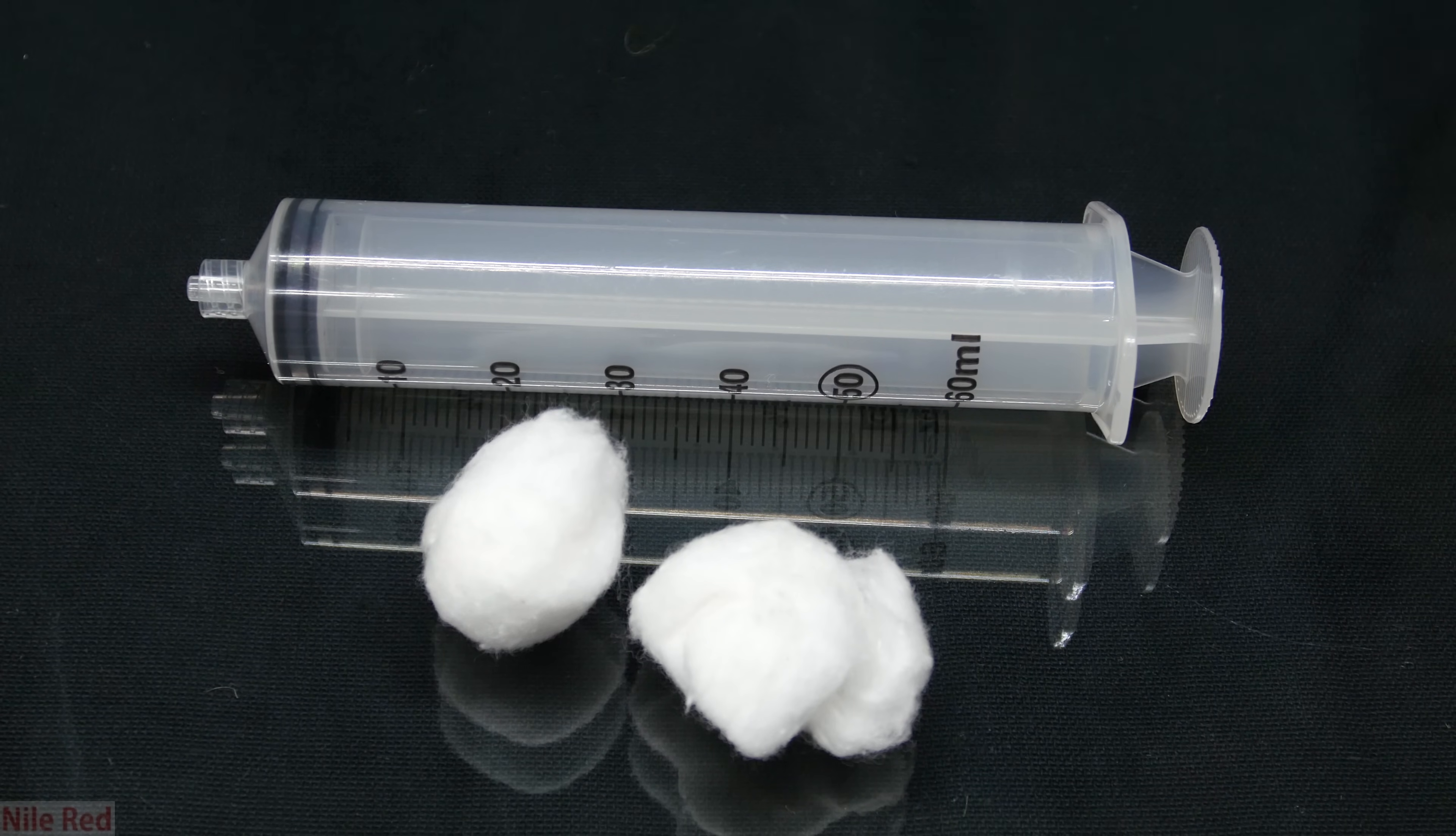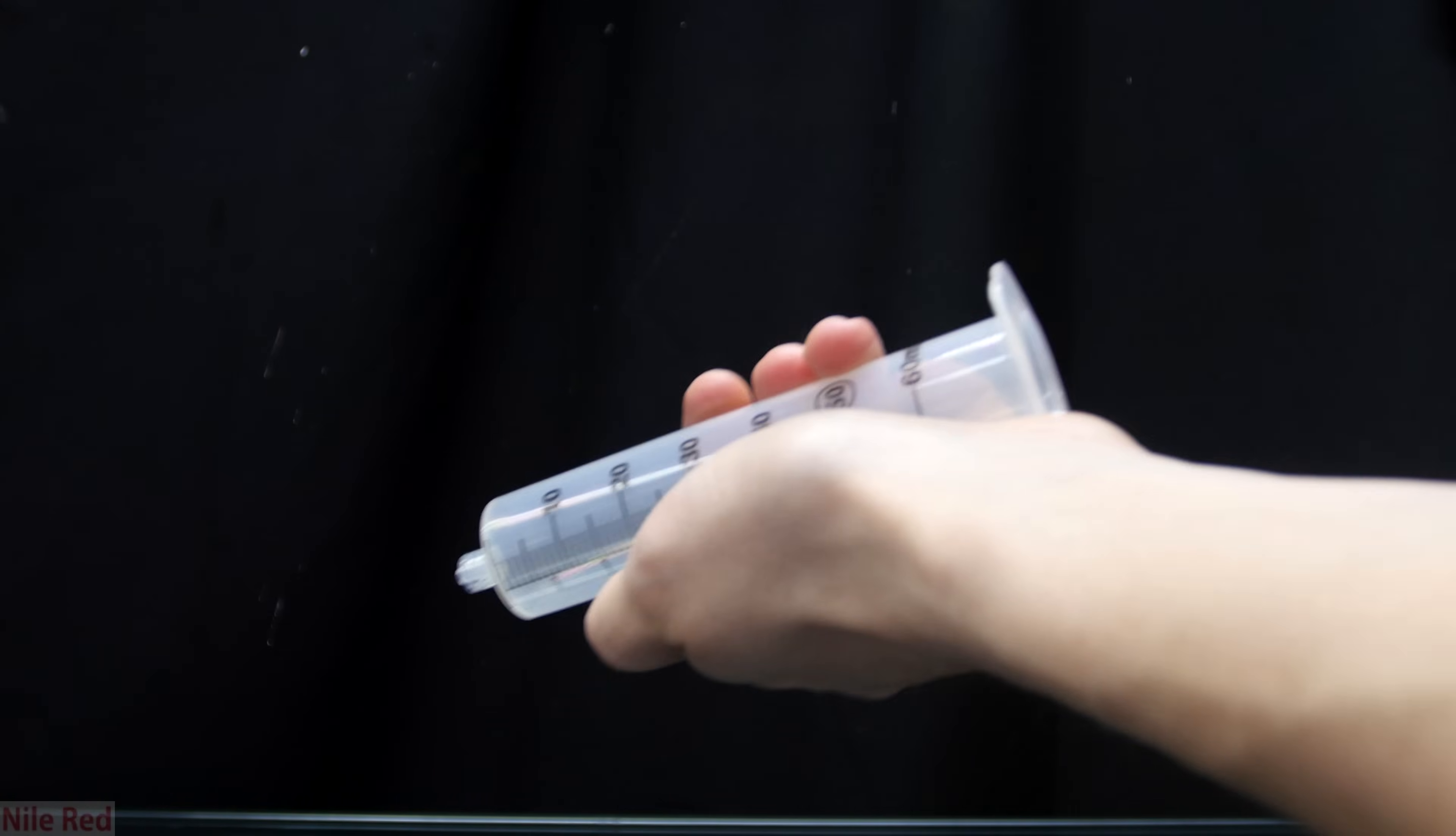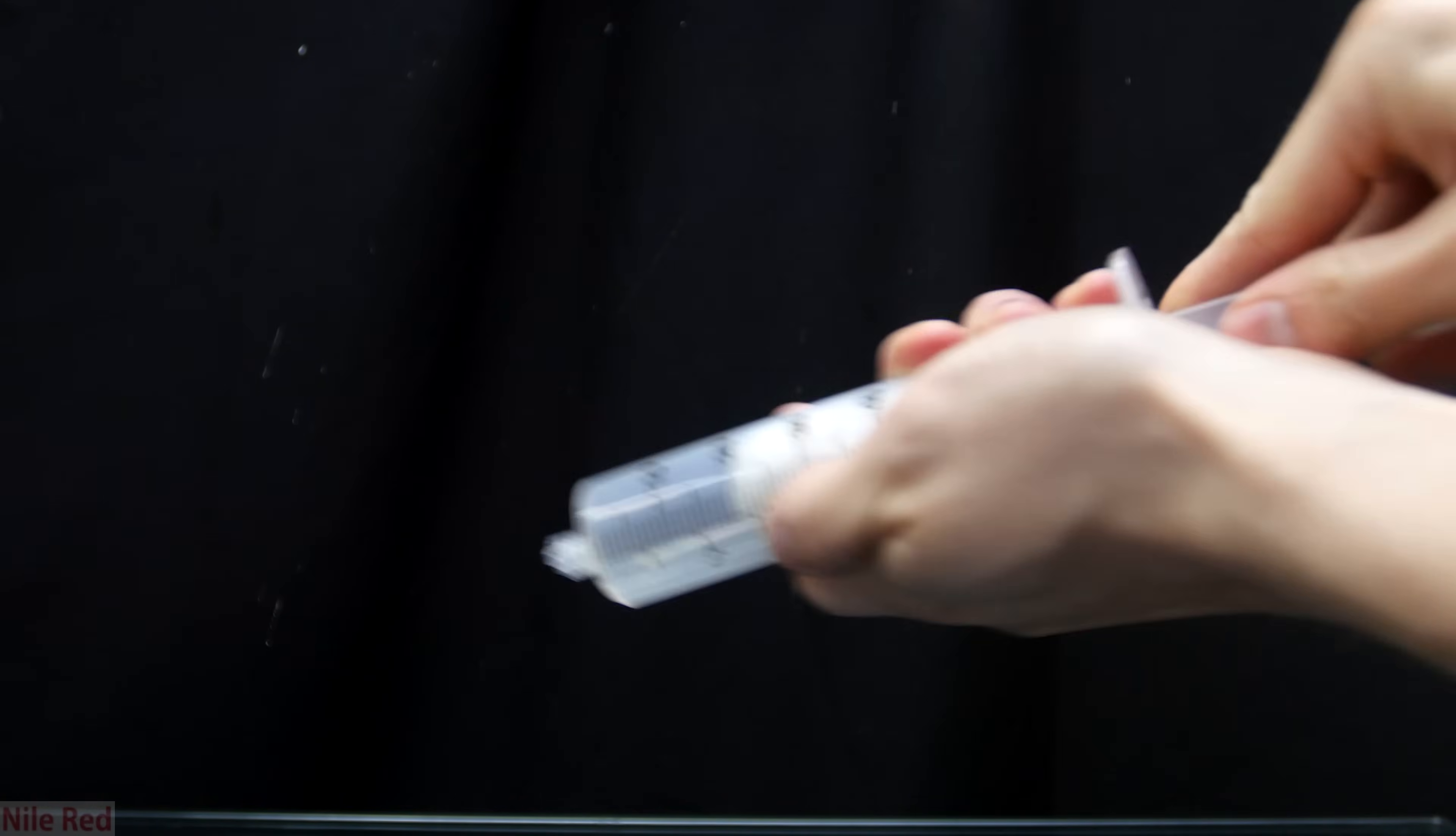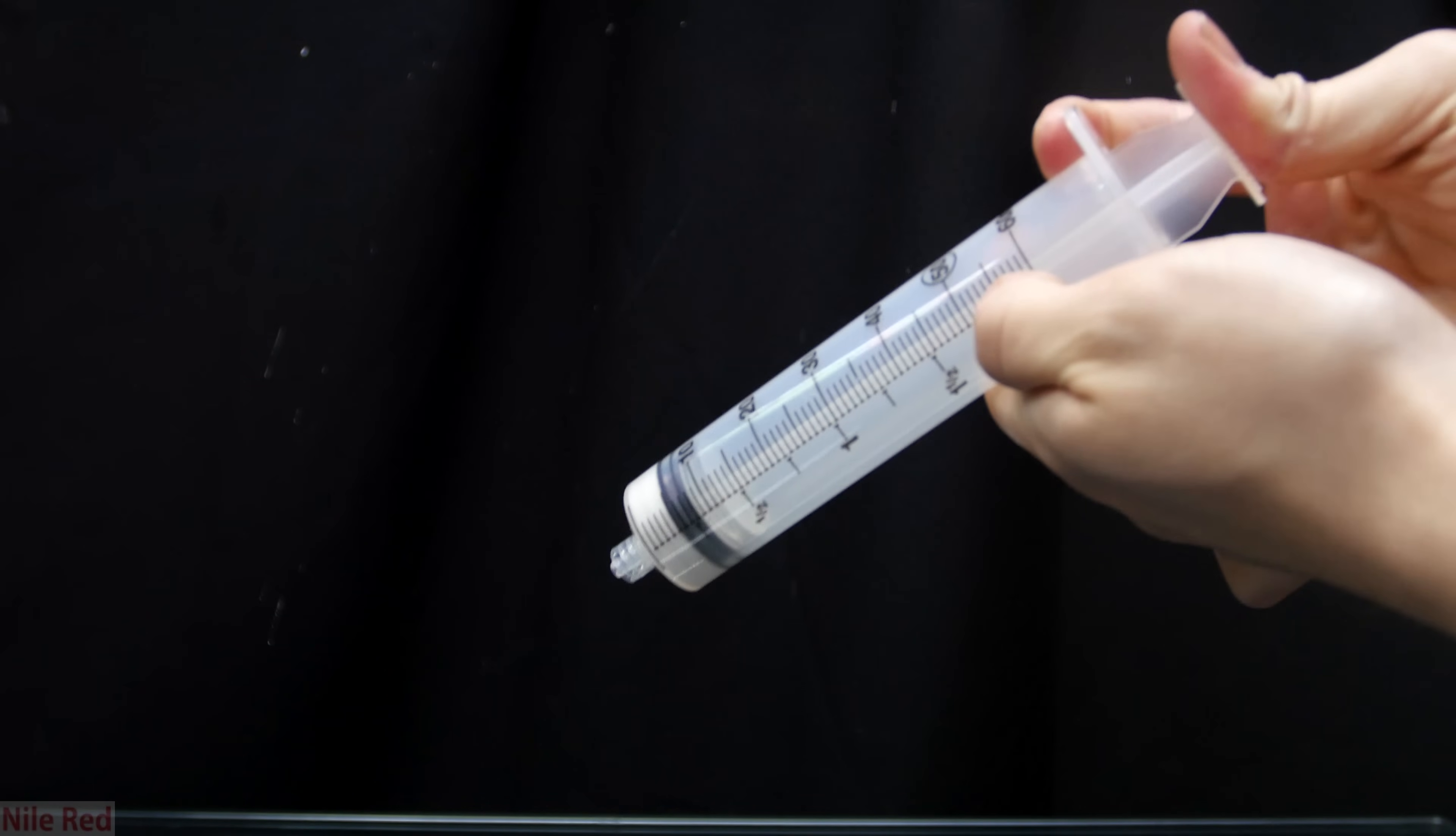For the first part of the process we need to filter the mercury and I find the best way to do this is using a syringe and some cotton balls. To prepare our filter it's really easy and we just put some cotton balls into the syringe and then jam it down to the bottom using the plunger. It's important to pack the cotton balls down as tightly as possible.